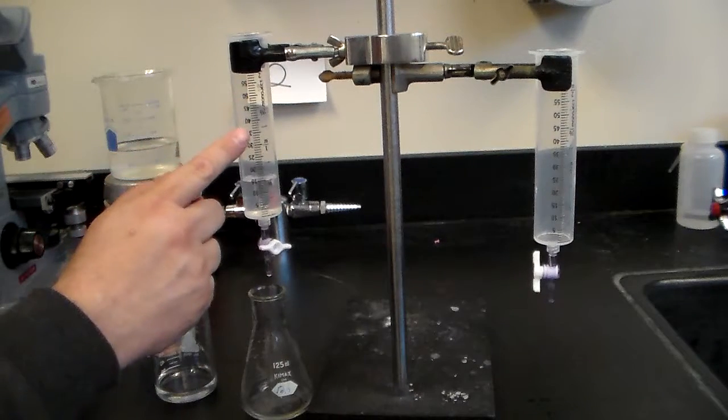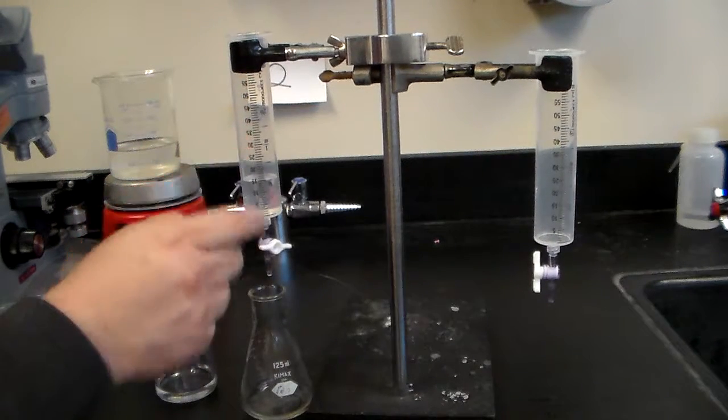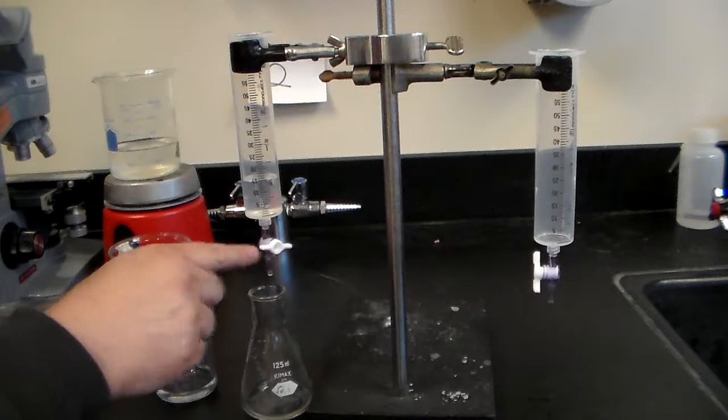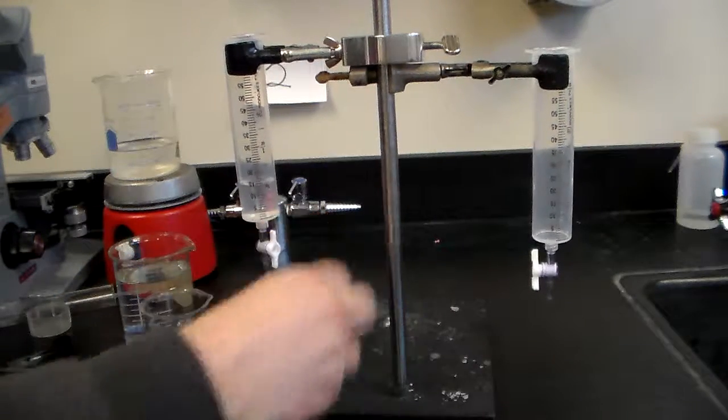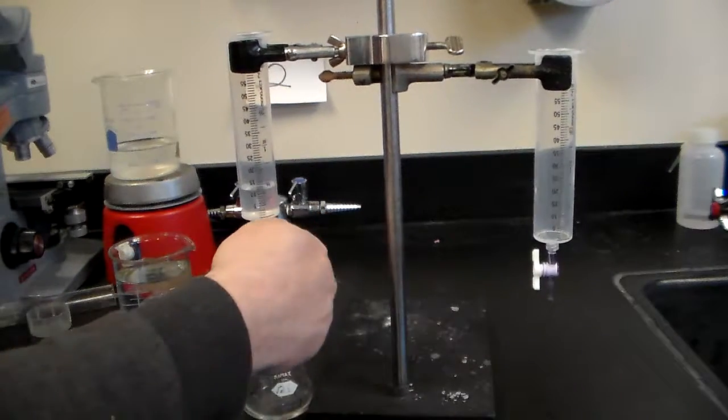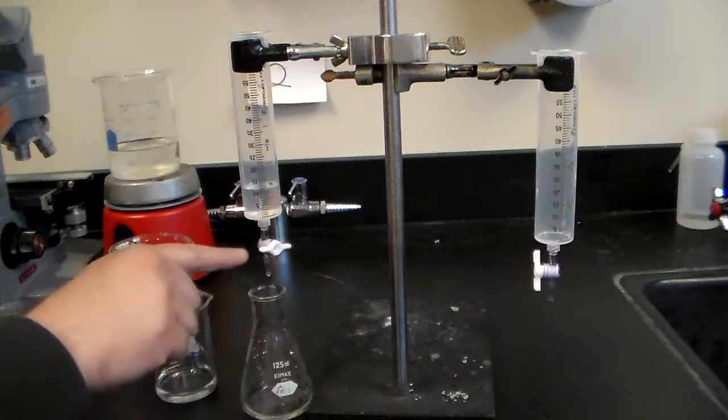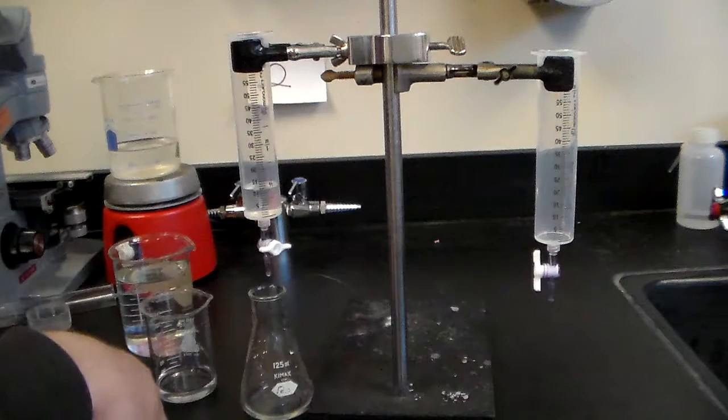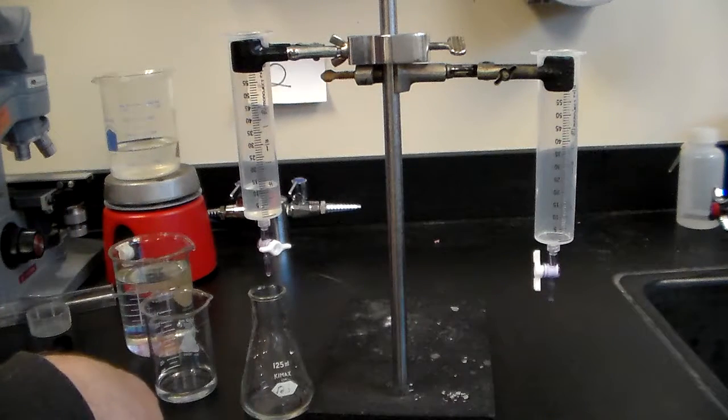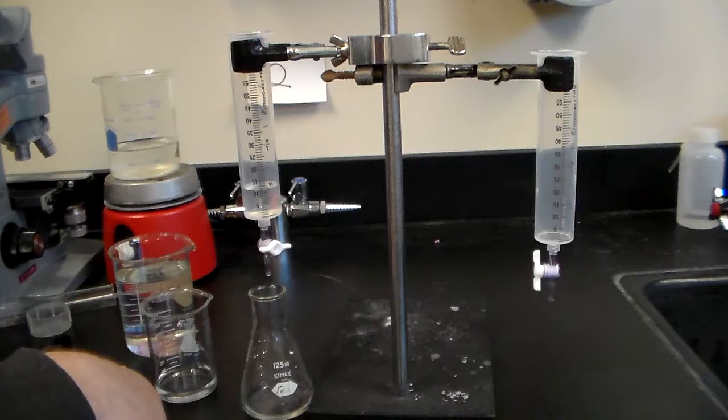You're going to fill the burette to a certain volume. You're going to make sure there are no air bubbles in here by turning the nozzle like this to allow the water, well in this case it's water, to flow through so there are no air bubbles in here, because that will disrupt the lab, that will disrupt your data.